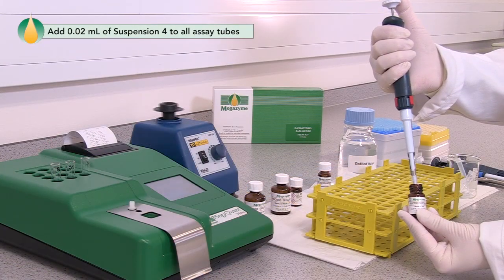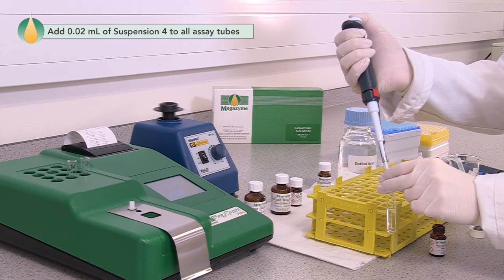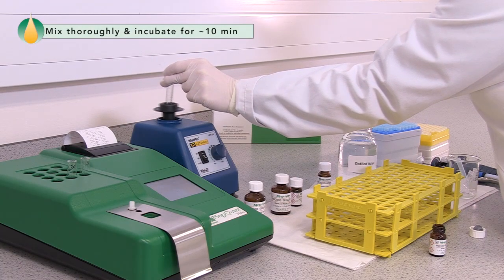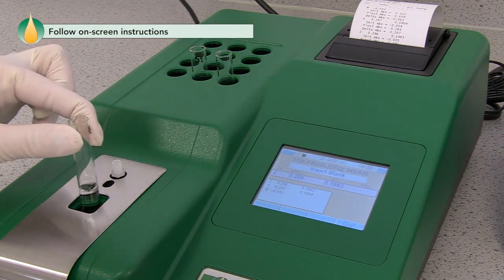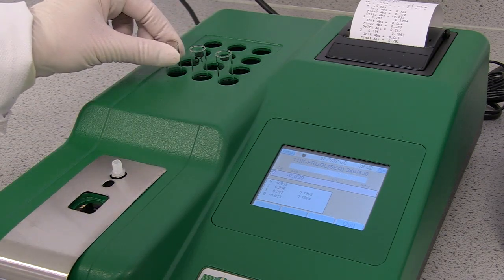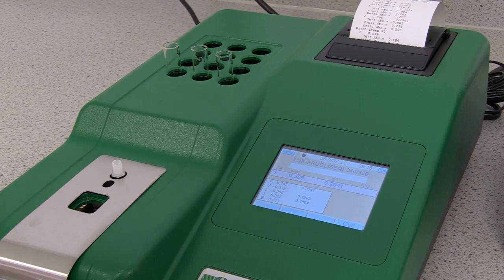After recording the absorbance reading A2, pipette 0.02 ml of suspension 4 into all assay tubes. Mix thoroughly and incubate in the incubation block of the MegaQuant Wave for approximately 10 minutes. After the incubation, follow the on-screen instructions on the MegaQuant Wave and record the final absorbance reading A3 for all of the assay tubes. This absorbance reading completes the measurement for D-fructose, and the results will be output to the onboard printer or the SFCapture software screen.